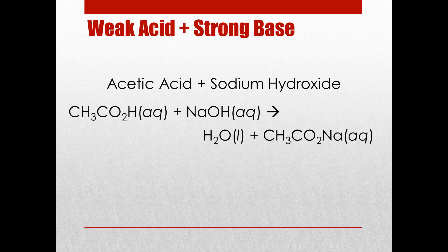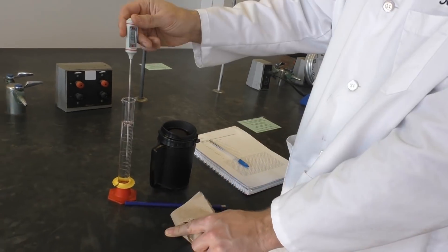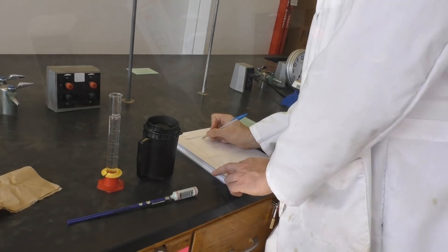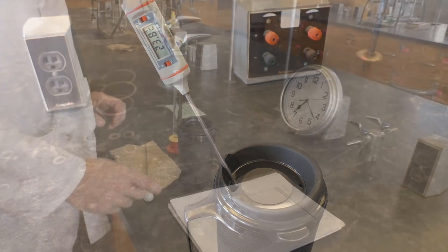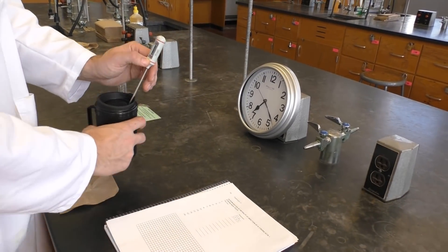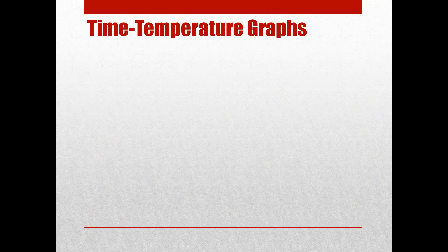Again, to measure the heat of this reaction, all you'll need to do is mix the two solutions in your calorimeter and monitor their heat by taking the temperature. Just like before, add 50 mL of NaOH to your calorimeter, rinse your grad cylinder, then measure out 50 mL of acetic acid. Let the two solutions come to the same temperature, then add the acetic acid to your calorimeter, cover, swirl, and record the temperature every 15 seconds for 3 minutes.